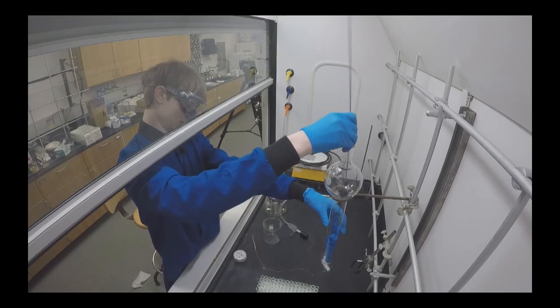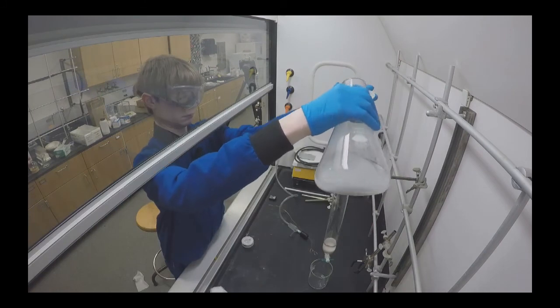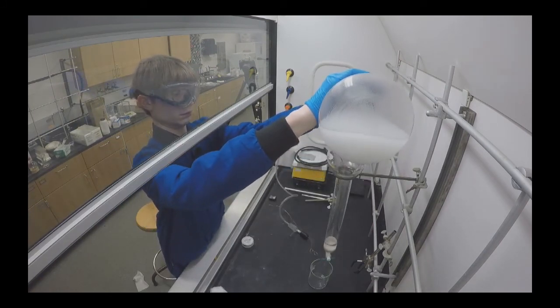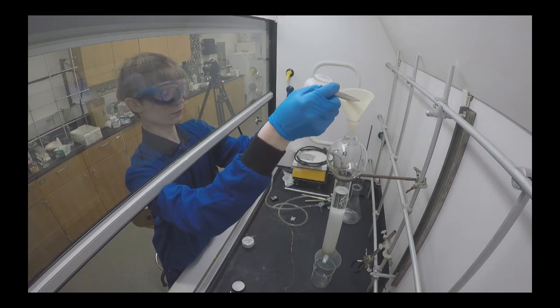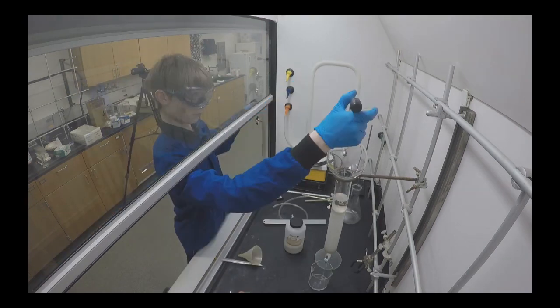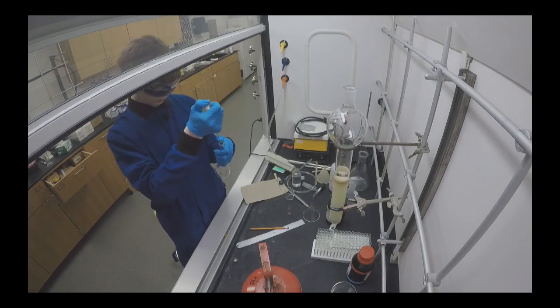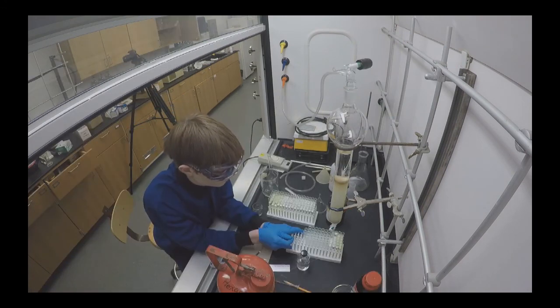In the lab, after running a reaction, I need to be able to actually characterize the exact product I've obtained. This is where purification comes in handy. You can see in the video I'm preparing a column, which is basically a really fine layer of sand that helps me separate the crude components from my reaction mixture. This gives me a very, very pure product, up to 99% purity, and allows me to characterize my products in NMR and figure out their exact structure. This is a very key aspect of my research.